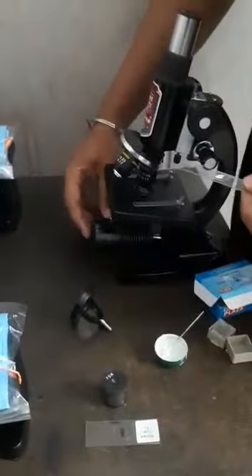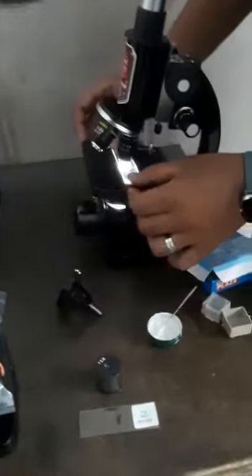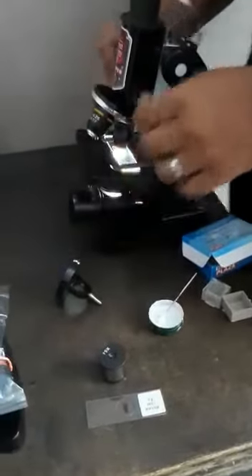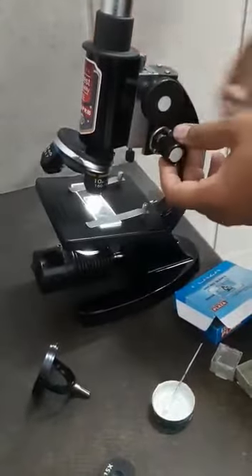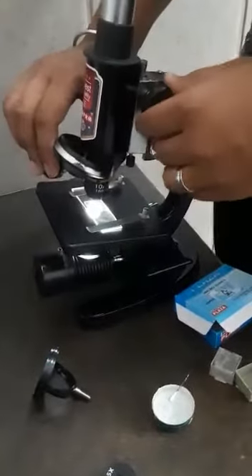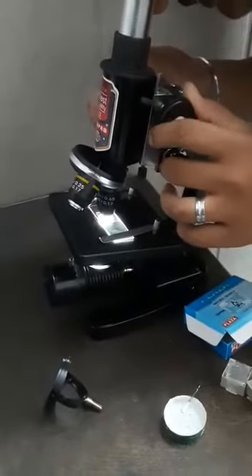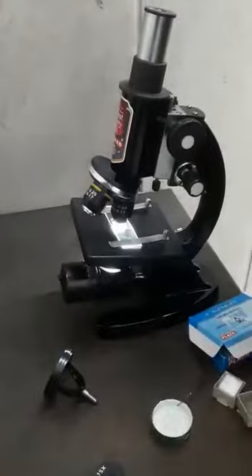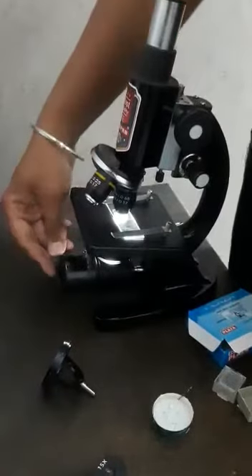Switch on the lamp and place the slide under the microscope. Starting with 10x, I can see some results — use fine motion to remove blurriness. Switching to 45x, adjust with fine motion and I can see clear results. When you are done with your work, remember to switch off the lamp.